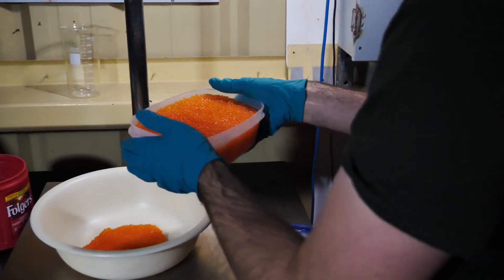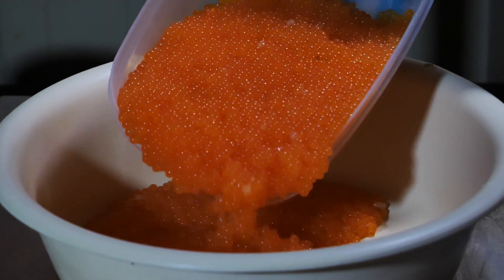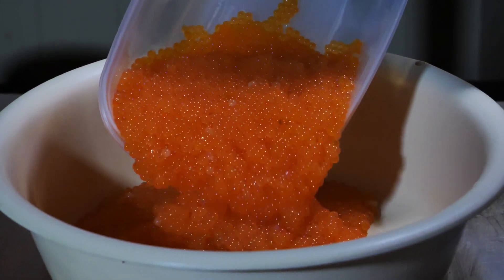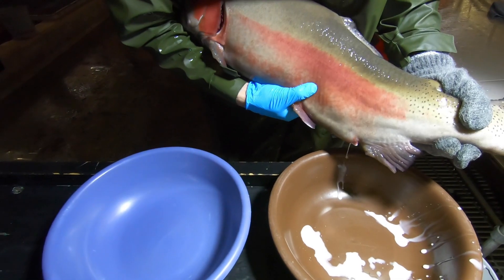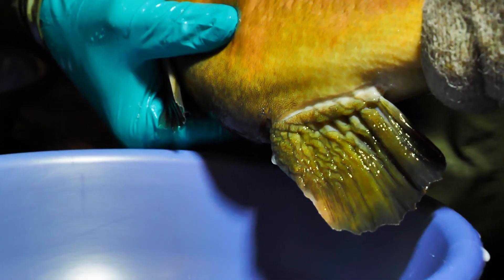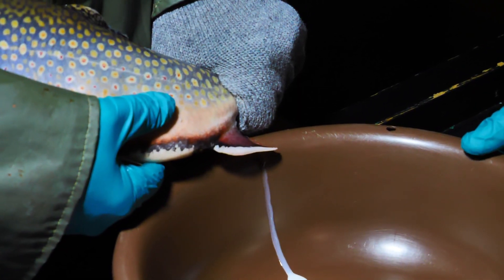The eggs are weighed to closely estimate the amount of milt required. Males are expressed to collect milt in 3 ml syringes. These are also moved to the triploidizing area in a cooler on ice.